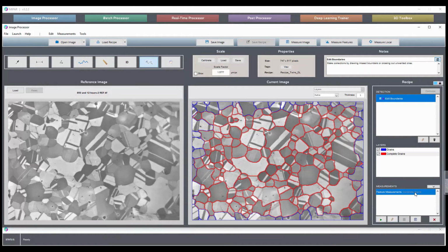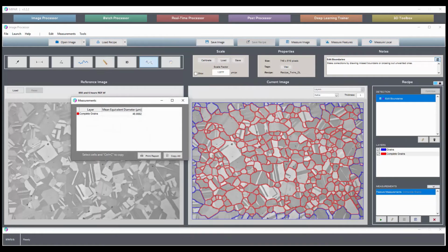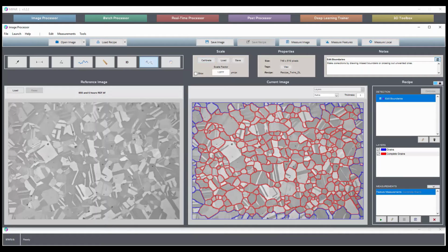Could do it another time. Fairly quickly to move through images and survey the results, see how the recipe is working. Maybe if you only have 5 or so images, that's the workflow that you need. But we can take it a step further and run it fully unattended.